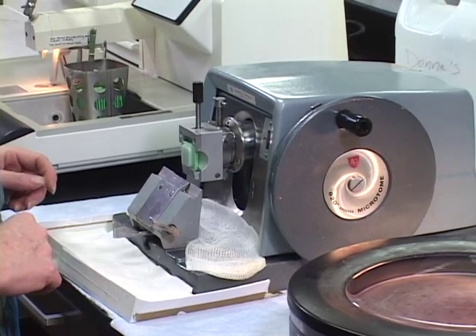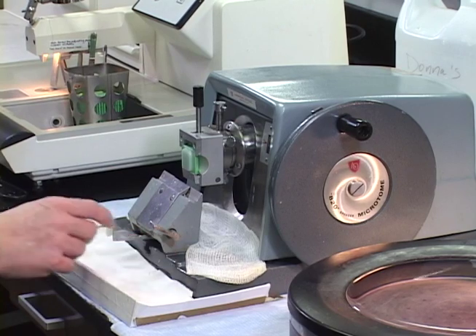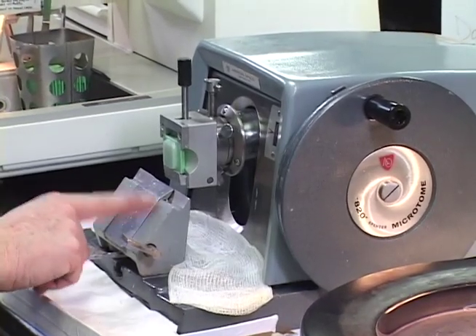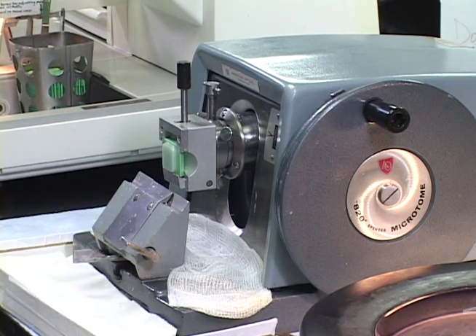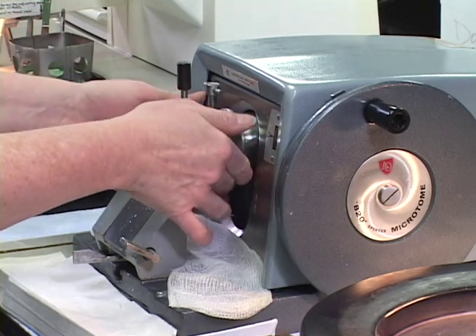So, some other things. I started to talk about this knife holder. Again, this knife holder has 2 screws. That's actually for tightening. You really shouldn't have to mess with those screws too much. I've marked a little tiny green mark where you need to align that screw for the optimal cutting tightness. Nothing on this machine, everything should be finger tightened nicely.